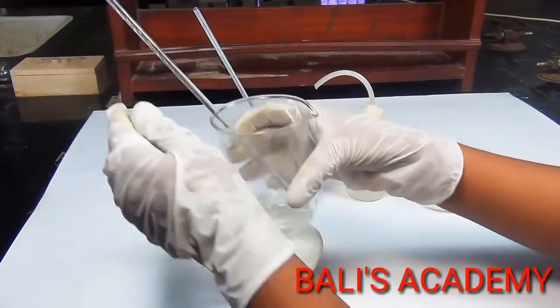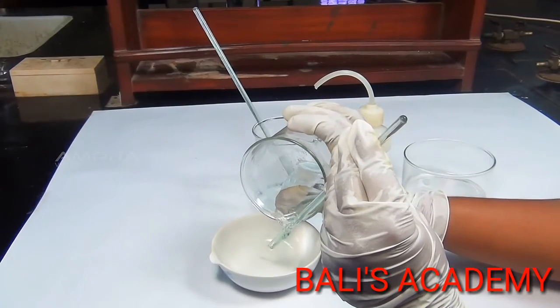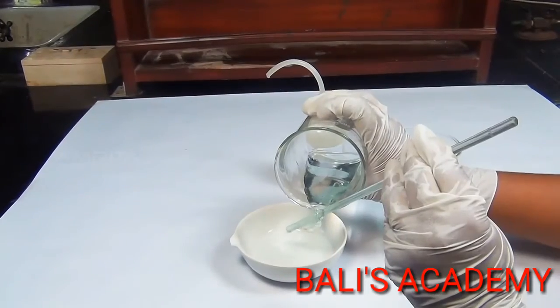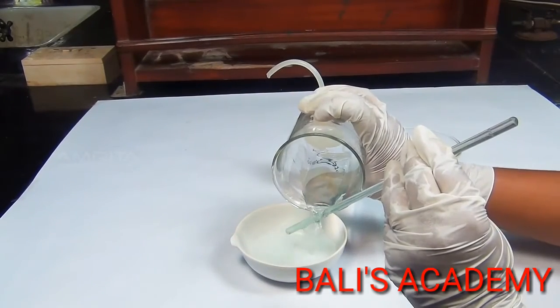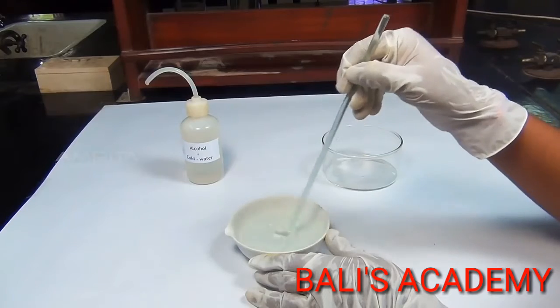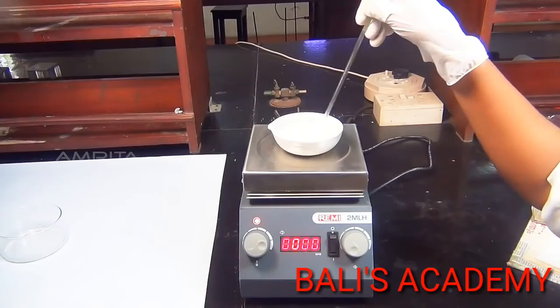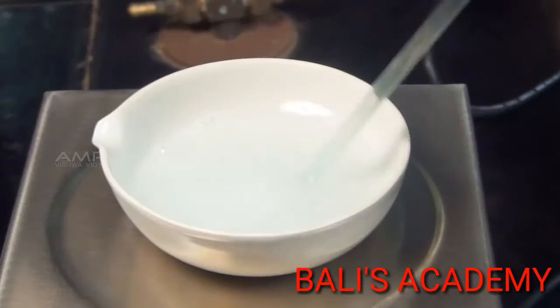Now transfer potassium sulphate solution into the china dish, then transfer aluminium sulphate solution into the same china dish. Mix the two solutions in the china dish using a glass rod. Heat the solution in the china dish over the hot plate.